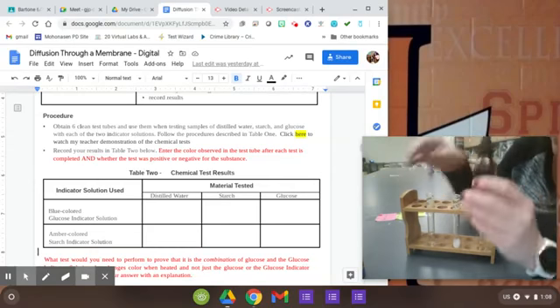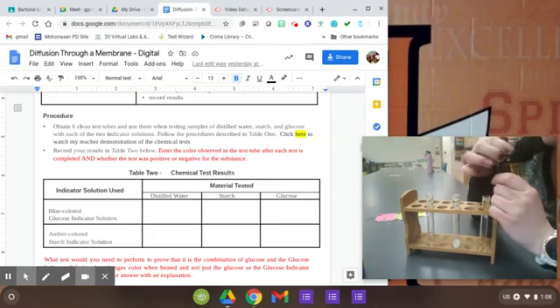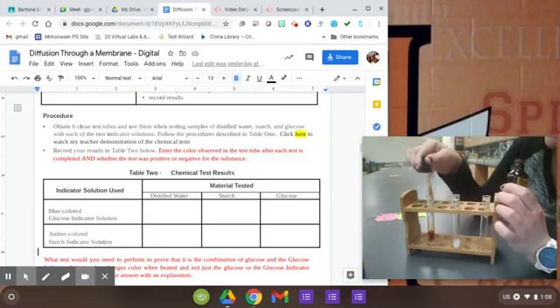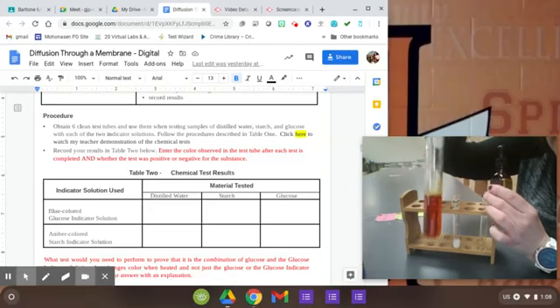It will change immediately. But we're going to put starch indicator in distilled water. So hopefully I would not expect to see a color change. Will it change to be this amber color? Yep, sure will. That doesn't really count as a color change because that's the color that it was originally. So this is a negative reaction.